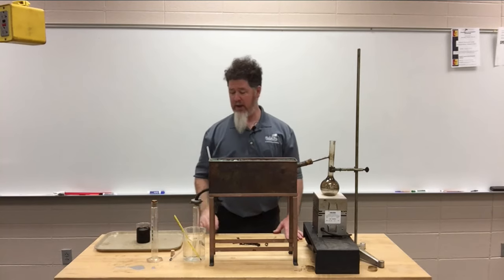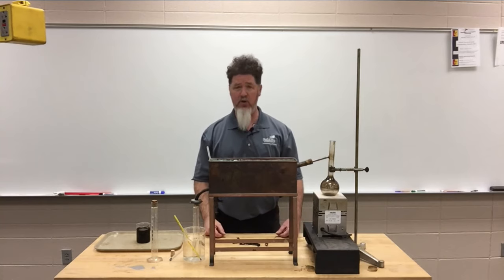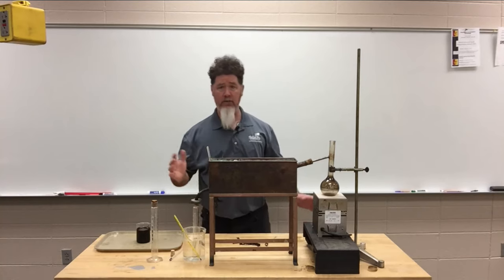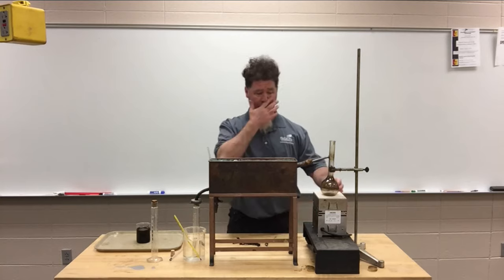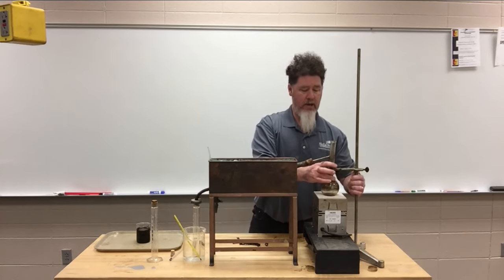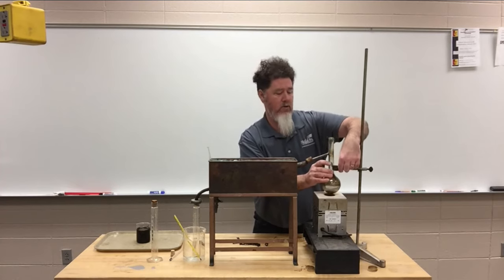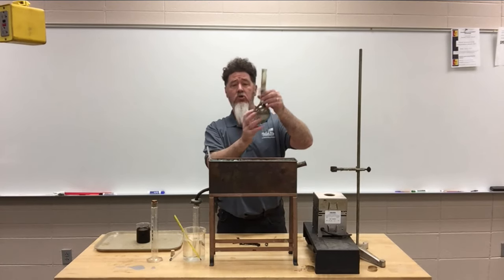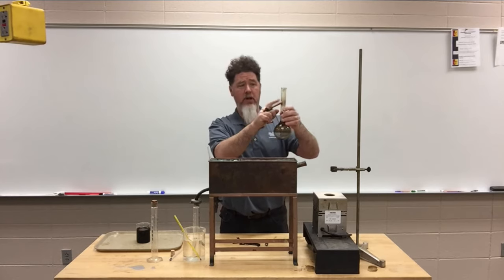So in order for that to happen, I've got to set up some equipment. I'm setting up the equipment before the students get here today. Let me just explain what I have right here. I have a ceramic heater, an electric heater that I'm going to heat up the crude oil in. And I have a distillation beaker. It's a round bottom beaker that holds 250 milliliters of fluid, and it has a tube coming out the end.